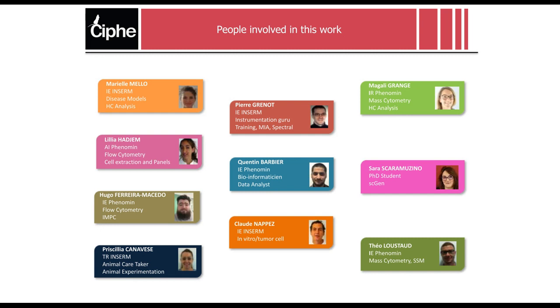You have a link with historical data, which makes it much easier to understand what is going on and what is being done, and to have confidence in the analysis that is driven in a supervised manner. Gating ML is the final one. Also, using this standard gating script, you can cross-validate data.